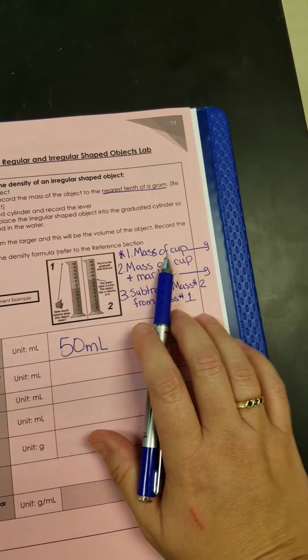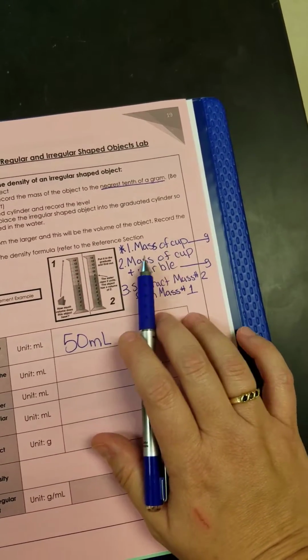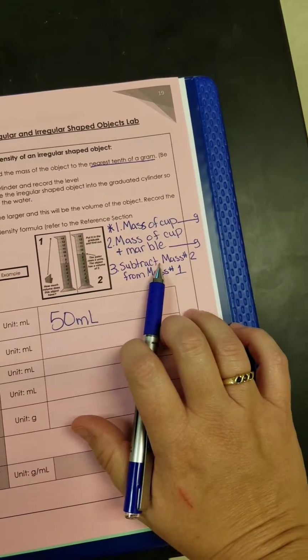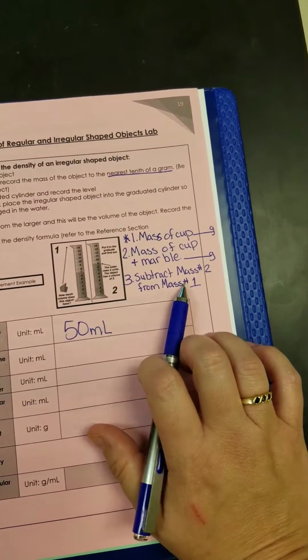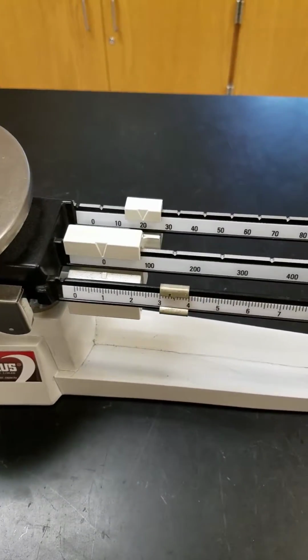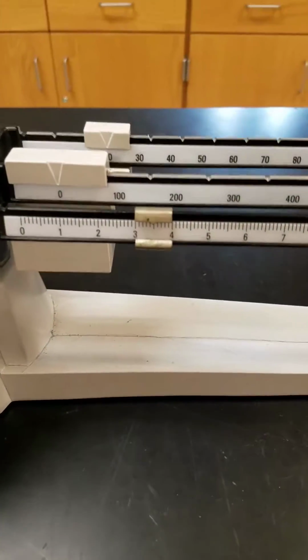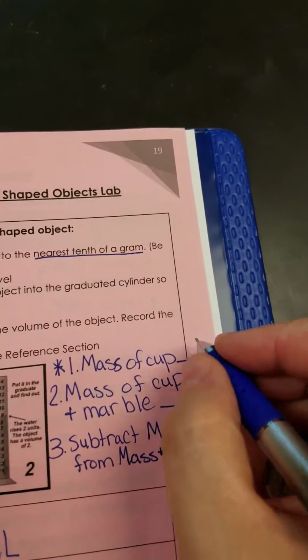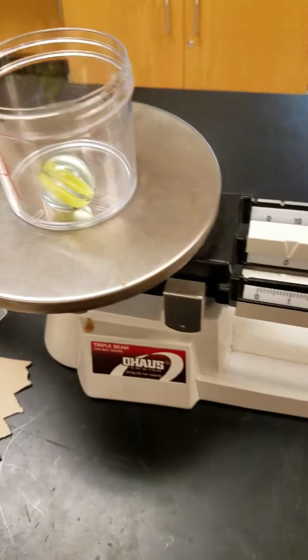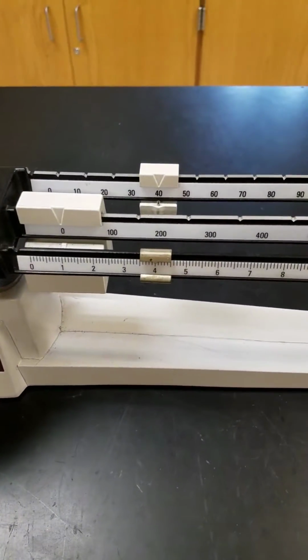So 1, we need to find the mass of the cup that our marble is in, and then we're going to find out the mass of the cup and the marble. Then we are going to subtract mass number 2 from mass number 1 to get just the mass of the marble. So there's the cup. Its mass is 23.5 grams. So the mass of the cup, 23.5. Now let's add our marble and see what that mass is. So with the marble in the cup, we are at exactly 44 grams.